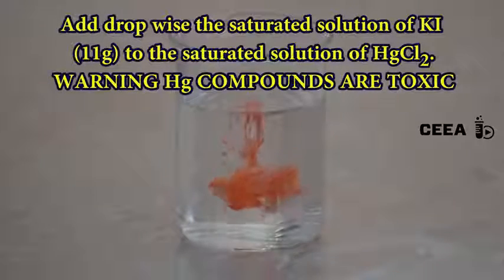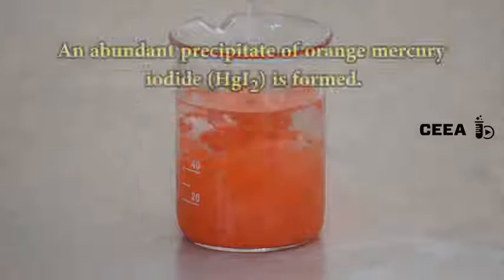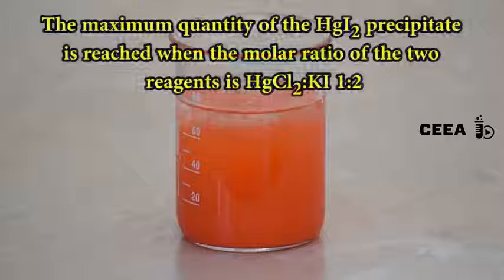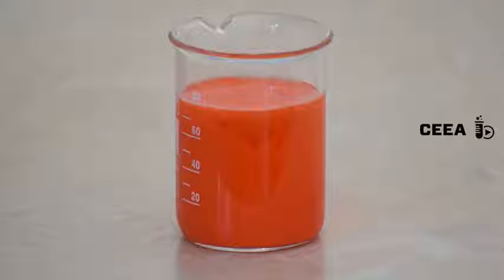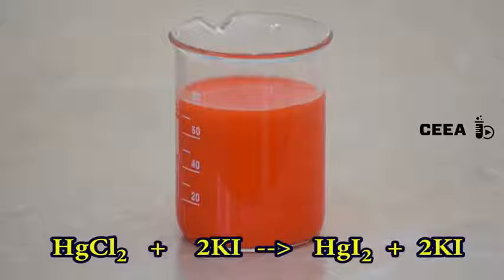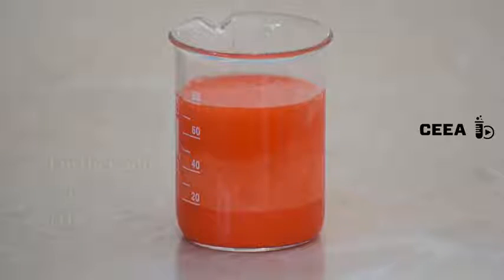Adding dropwise the iodide to the mercury solution, we notice the formation of an abundant orange precipitate of mercury-2 iodide. The most abundant precipitate is obtained when the mercury chloride and potassium iodide are interacted in a 1:2 molar ratio. The process is a double replacement reaction, as shown in the equation of this chemical reaction.